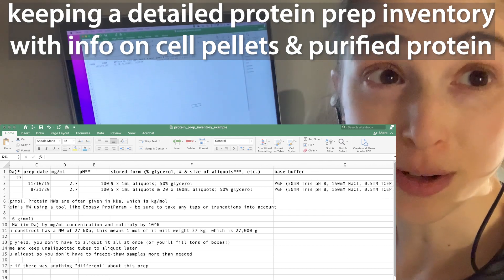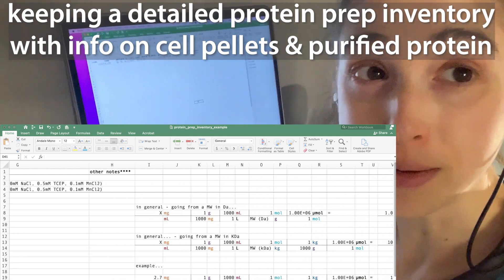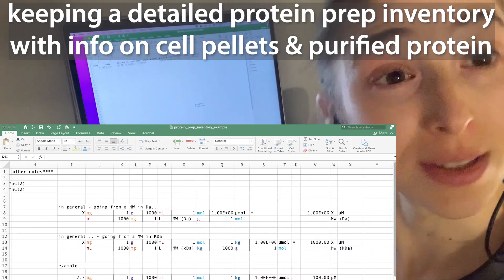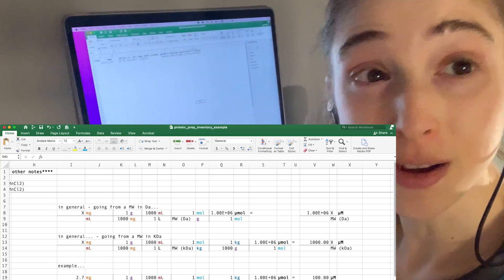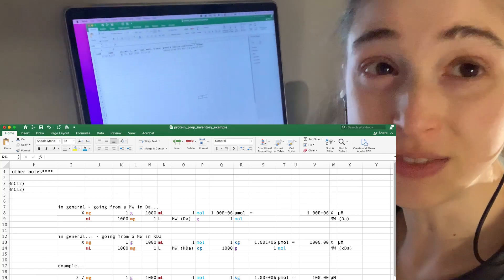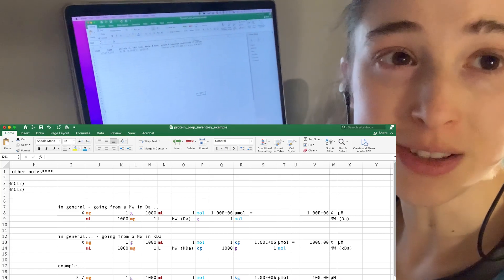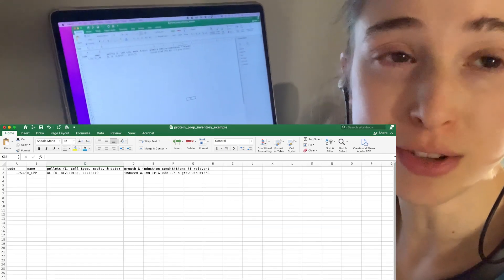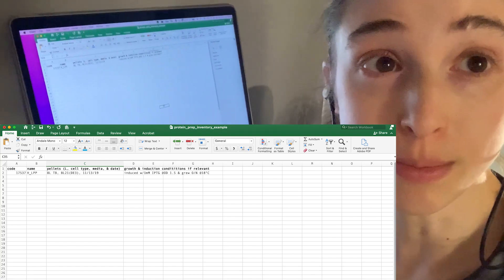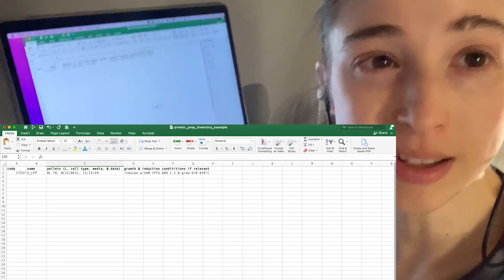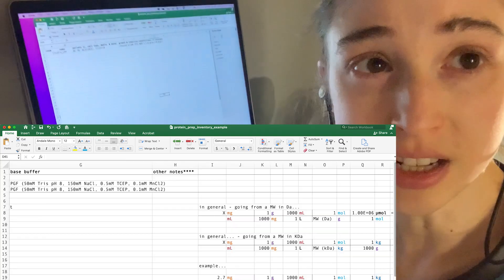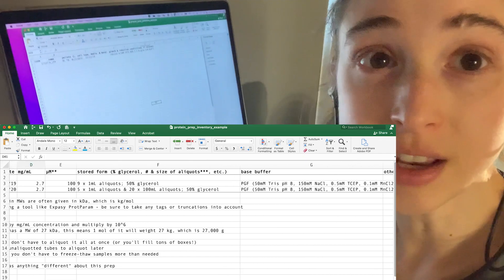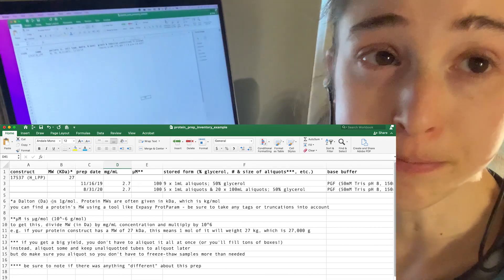As I prepare to express purified proteins, I'm preparing my protein prep spreadsheet and I want to show you how you too can achieve this feat. Okay, well it's not really a feat, but keeping an inventory of your protein expression, like the cell pellets, as well as your purified proteins can save you a lot of time down the line.